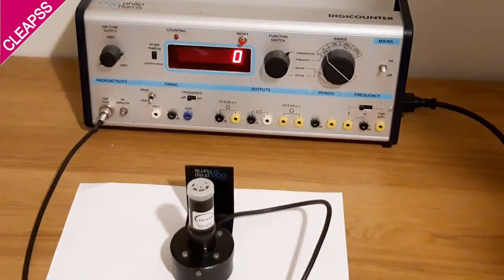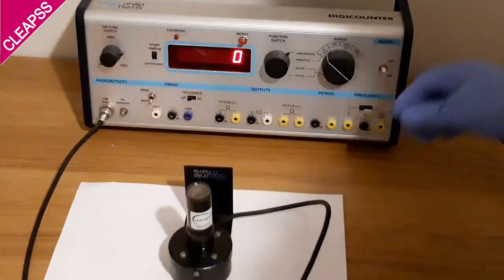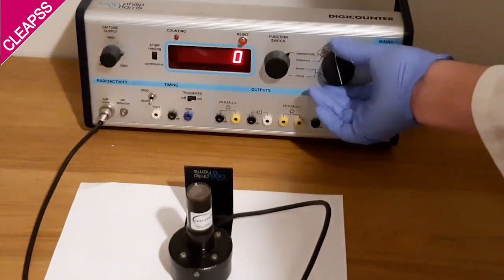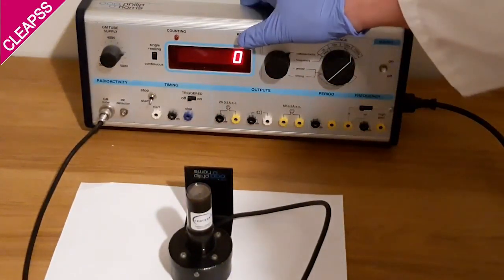So first of all I do a background count and I take the cap off the GM tube, set the voltage to 450 volts if it's variable, set the timer for 1000 seconds and start to count.